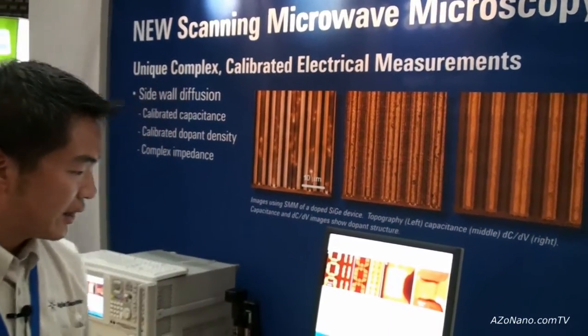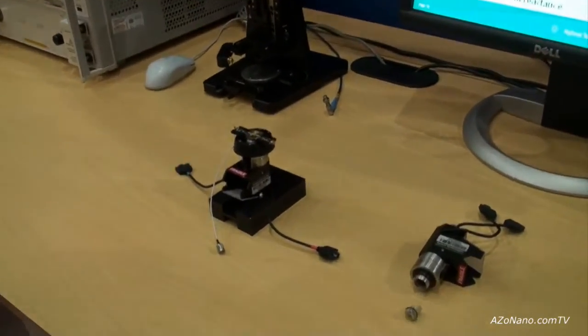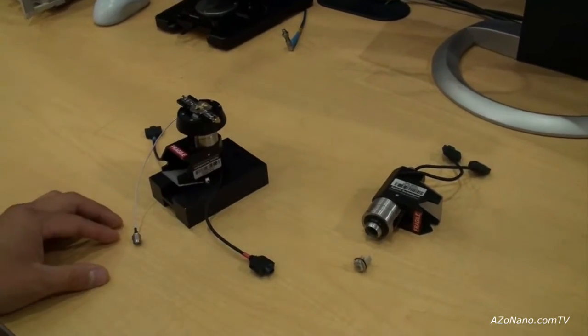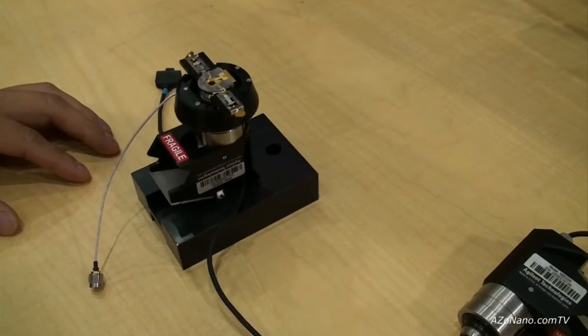This is the latest technique introduced since summer of this year, which actually merges two components of Agilent Technologies: the AFM and electronic measurements. Here we have the SMM, or scanning microwave accessory, that will fit onto all of their multipurpose scanners.